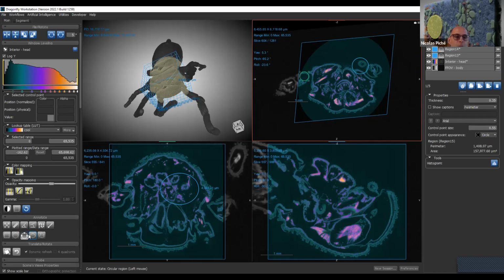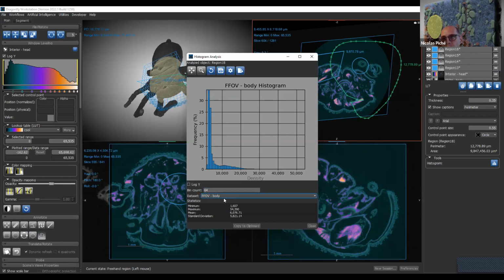You also have multi-point like this, and a free tool like that, from which you can also extract the histogram, of course. When we do the histogram, I think in that case we do a linear interpolation of the data in the plane. When you're in oblique, it seems simple. It's not rocket science, but it's like 40,000 lines of code just to play with the views and slice it in different axes.